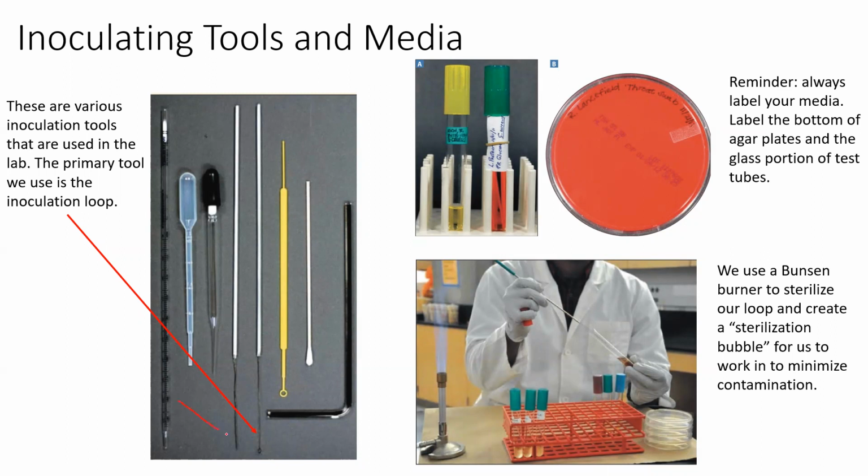So this right here is the inoculating needle. It's literally, we buy inoculating loops and we can cut off the ends so that it's just pointy. And that's what you use to stab the agar deeps. Okay, remember we said that those are important for motility and oxygen requirement experiments.